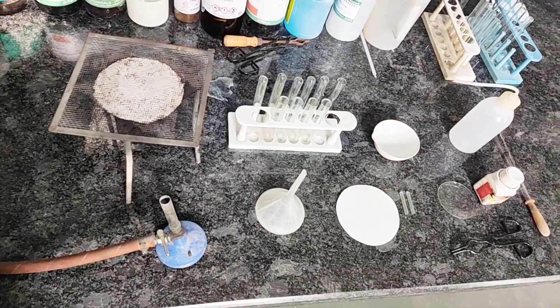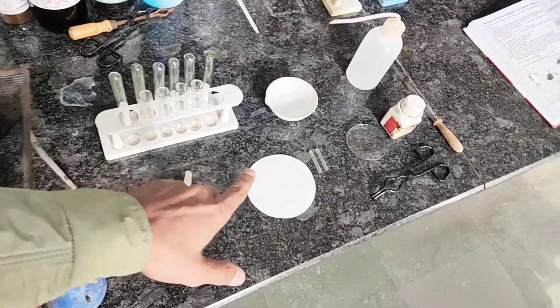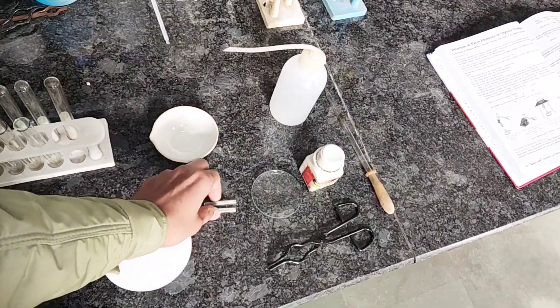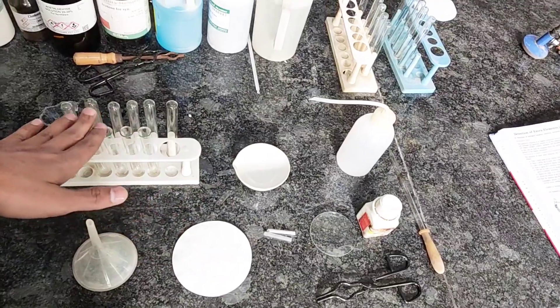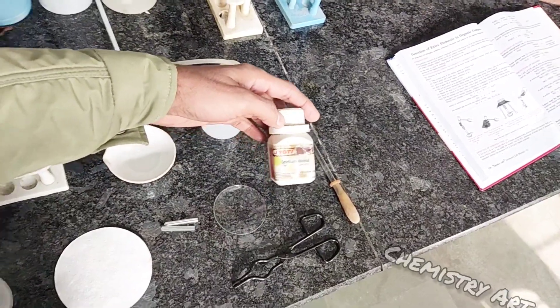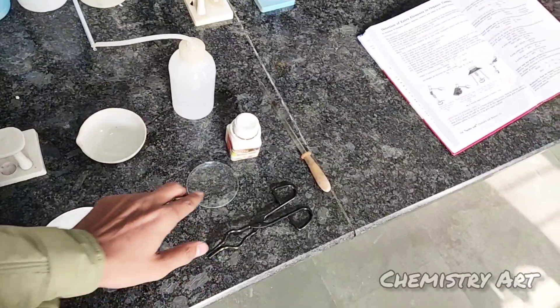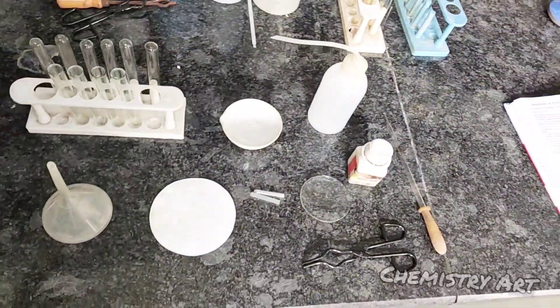To perform Lassaigne Test, we require these things: burner, tripod stand, wire gauze, funnel, filter paper, fusion tube, china bowl, test tube, test tube stand, distilled water, very important element sodium metal, tongs, dropper, and watch glass.